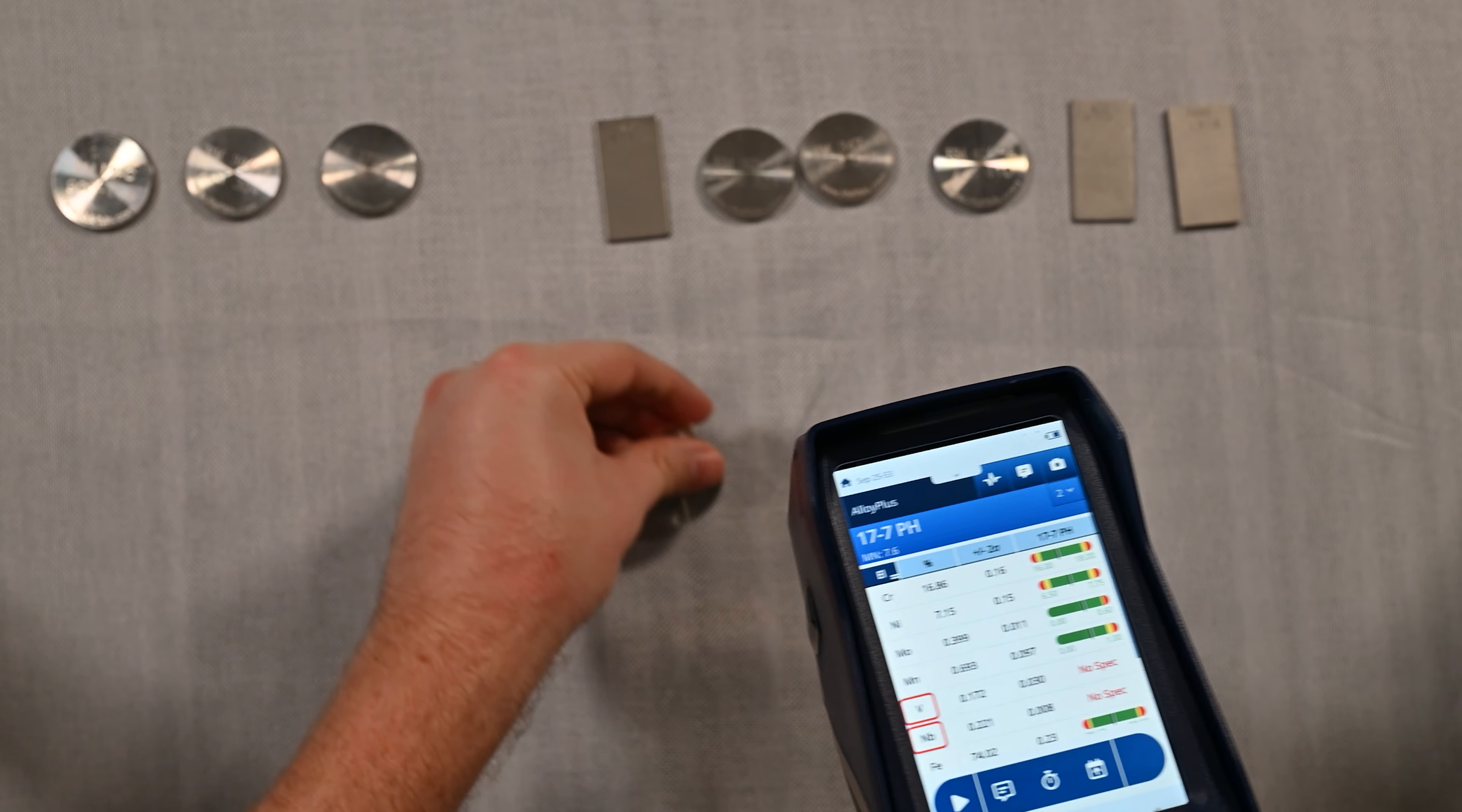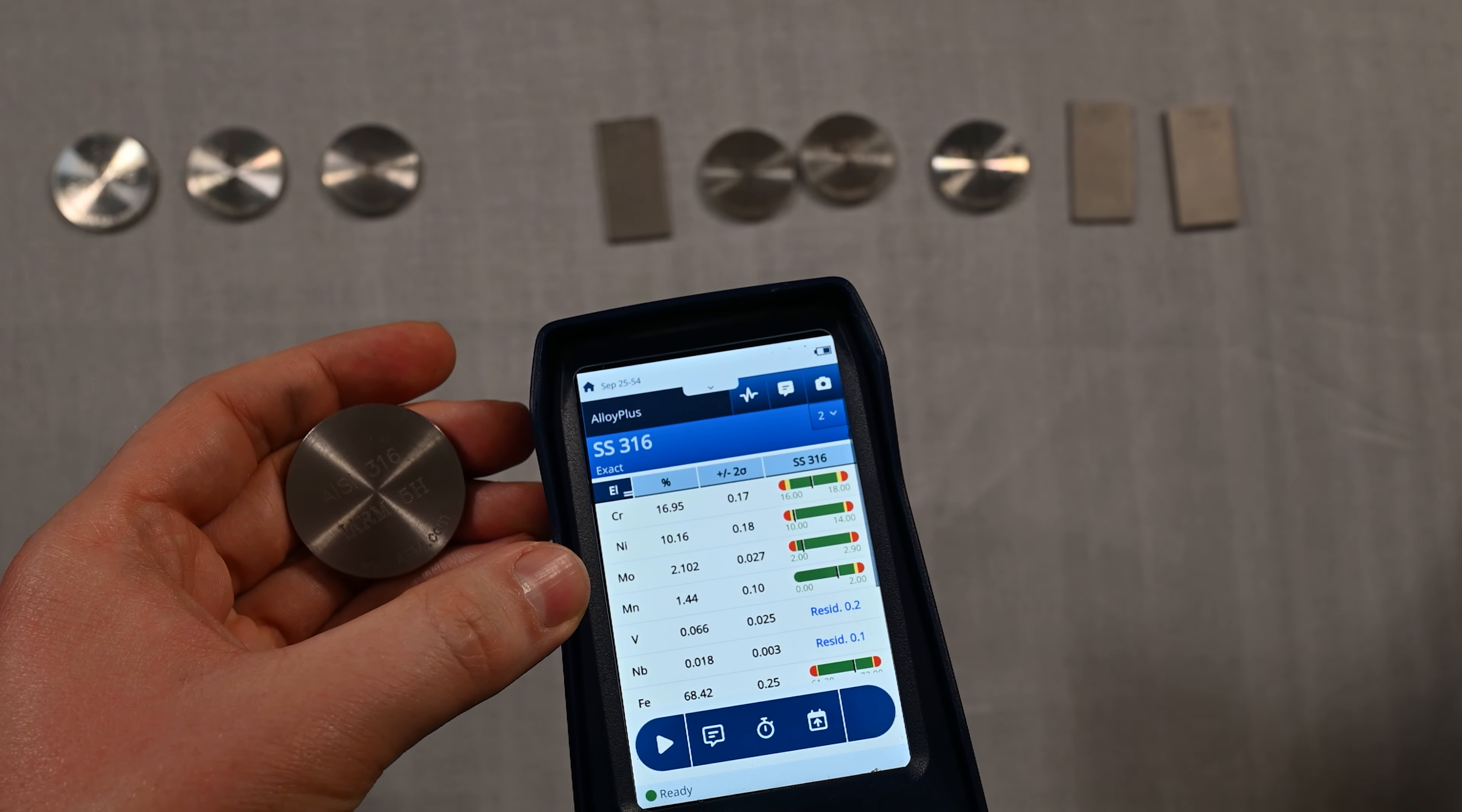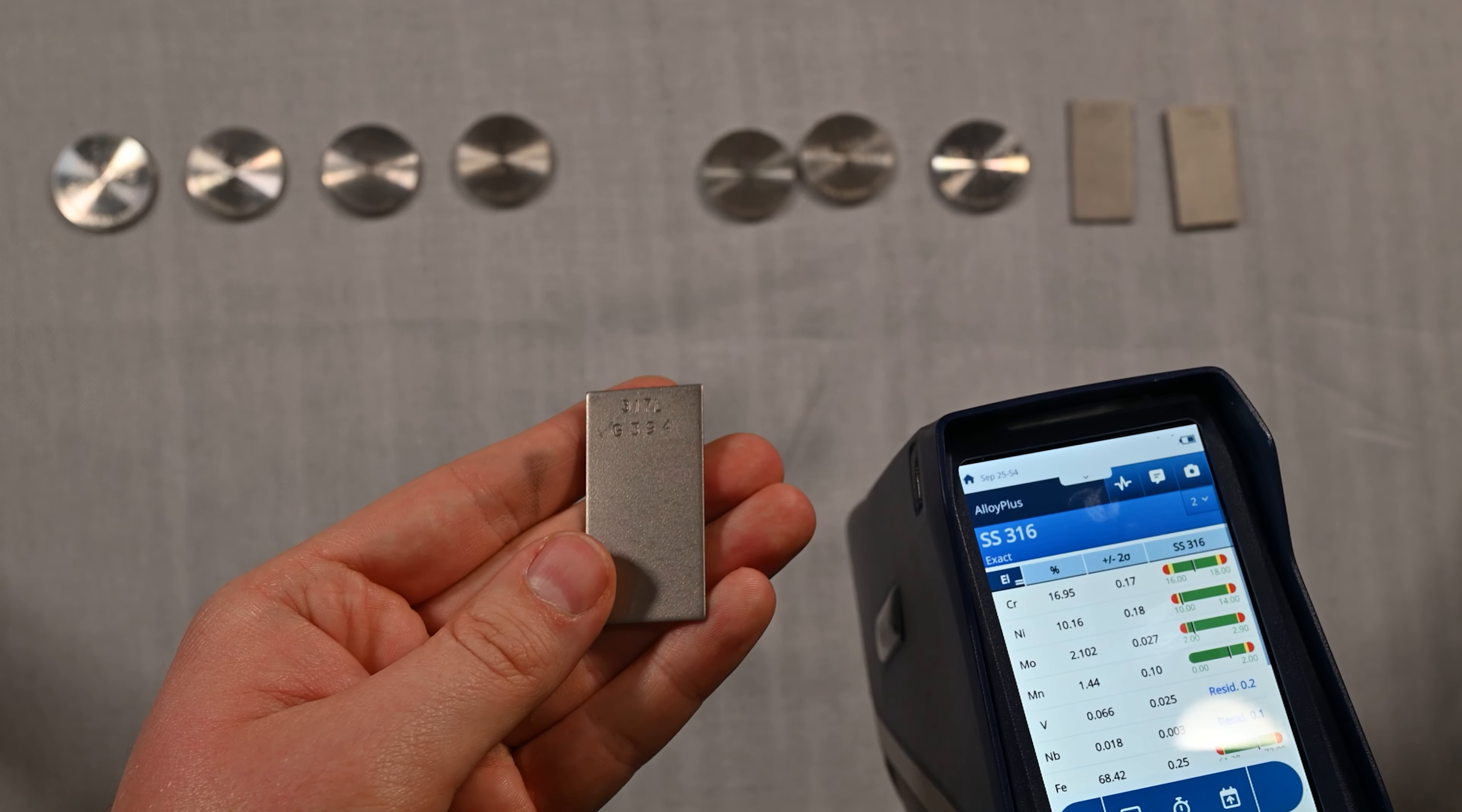Next up I've got one of the scrap yards' favorite metals to sort. This is 316 stainless steel. They're able to get a premium when they can find this because the molly, this 2% molybdenum abbreviated Mo here in the chemistry, is actually worth more money. So this is a high grade of stainless steel that fetches a premium price when it's being recycled.